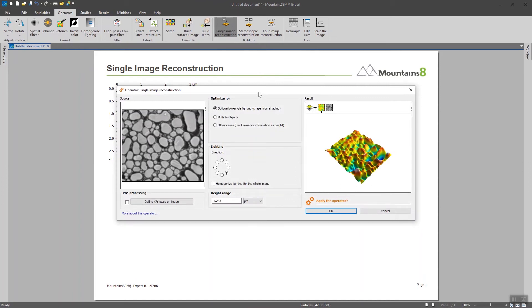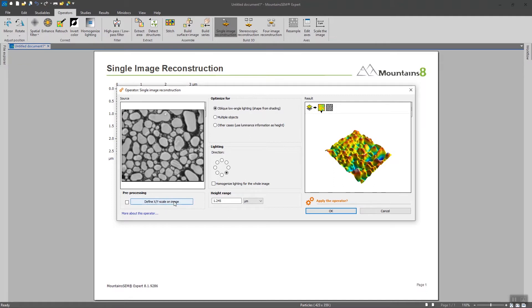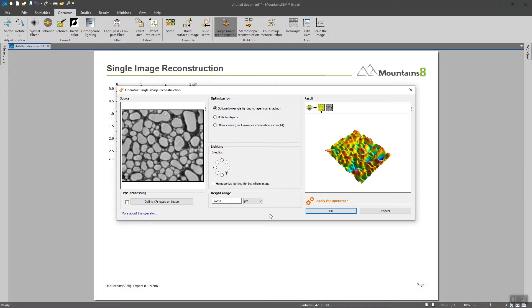Note that the single image reconstruction has no methodological value since we are only making the reconstruction out of one image. However, you can decide to define the XY scale on your image or to give the approximate height range of your sample in order to get a rough idea of the size of your image or the size of your elements on the image.